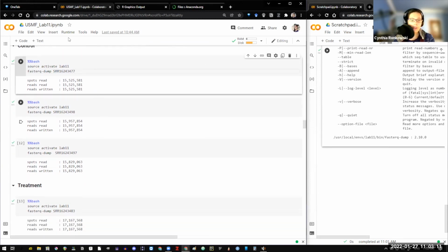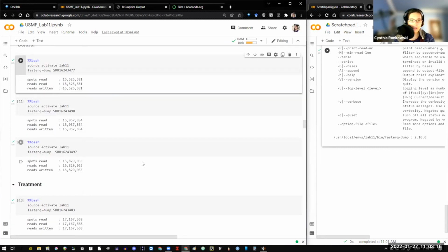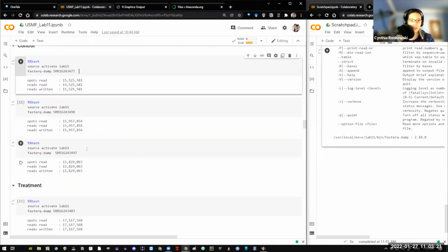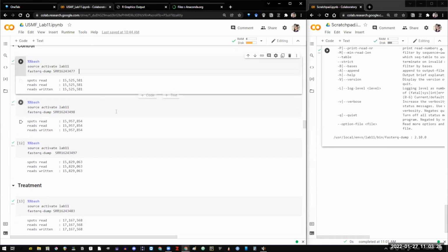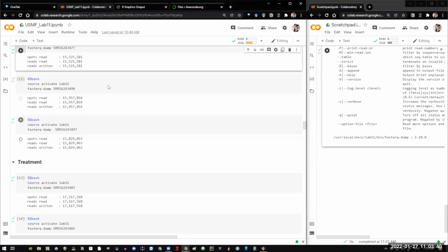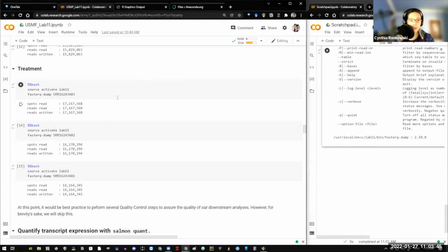So yeah, these will actually take in total maybe 30 minutes to download, maybe 40 minutes. I don't remember how long it took exactly, but it makes sense. It's very long. I started when we start the course, and just the second one is downloaded. I see. But yeah, it takes a long time since you're downloading millions and millions and millions of reads.